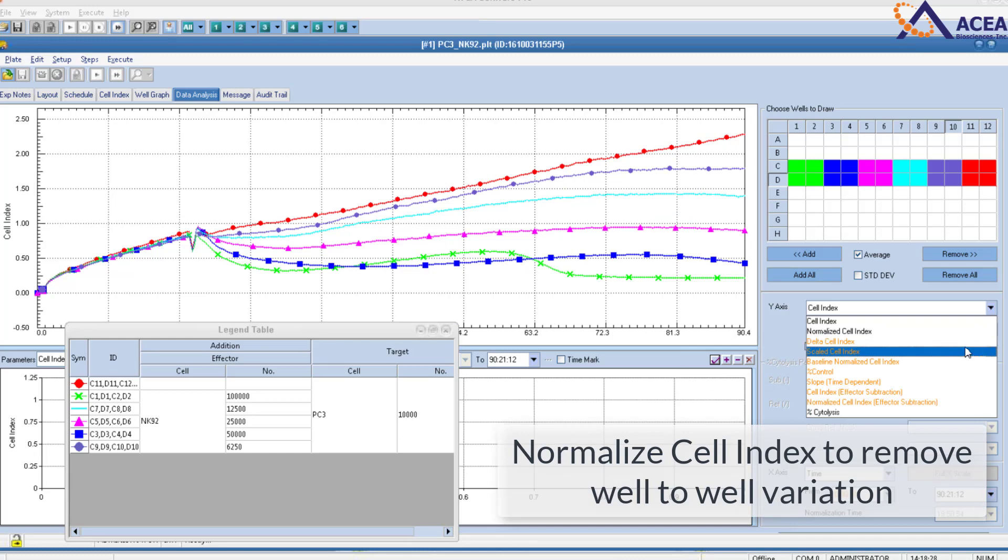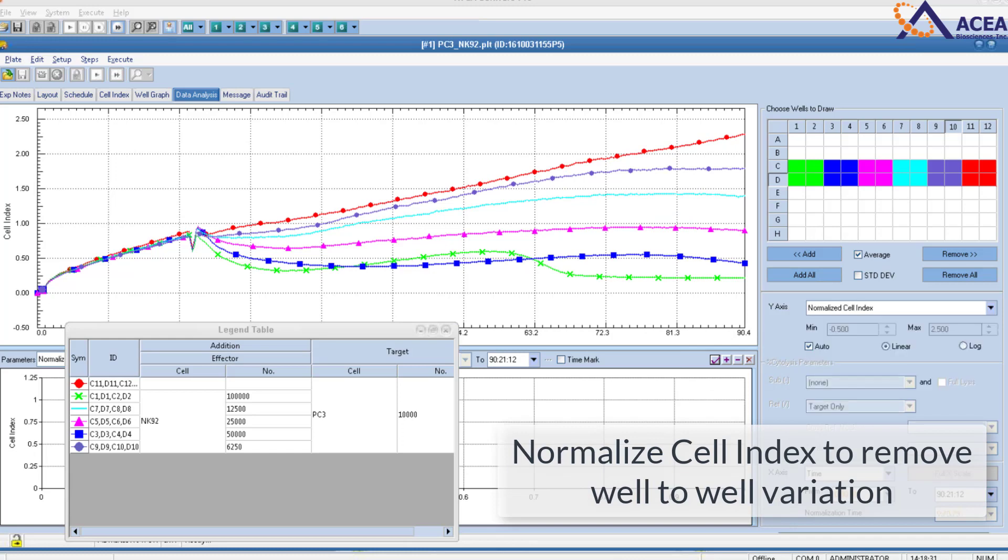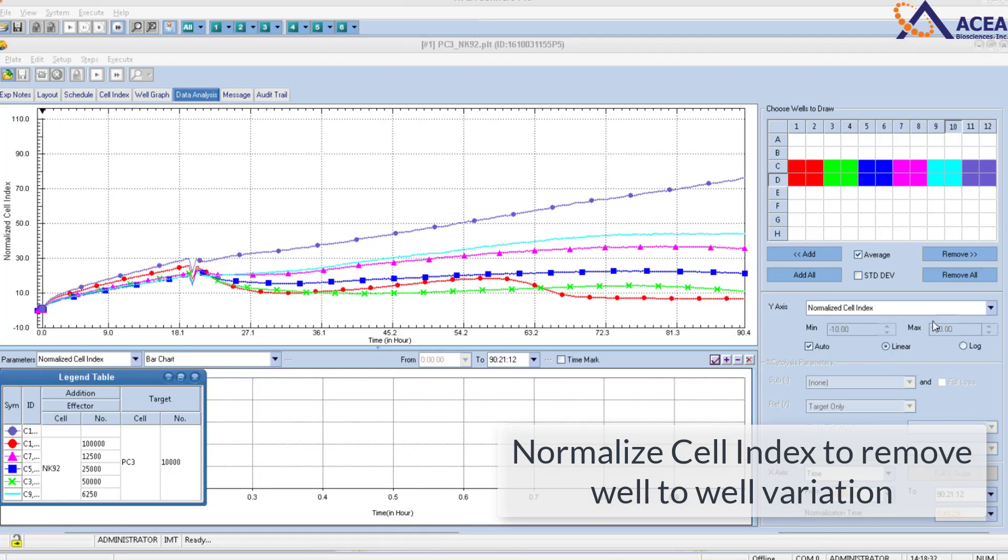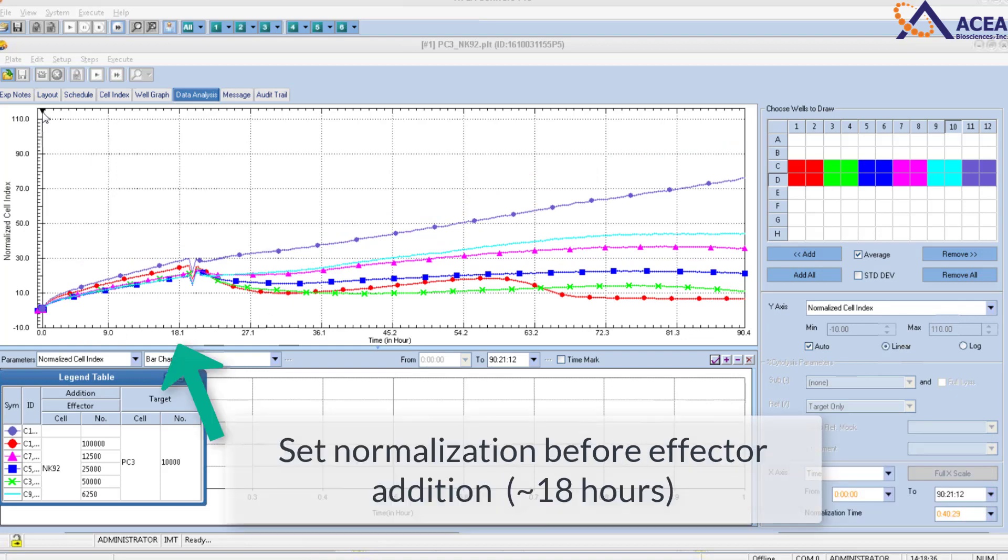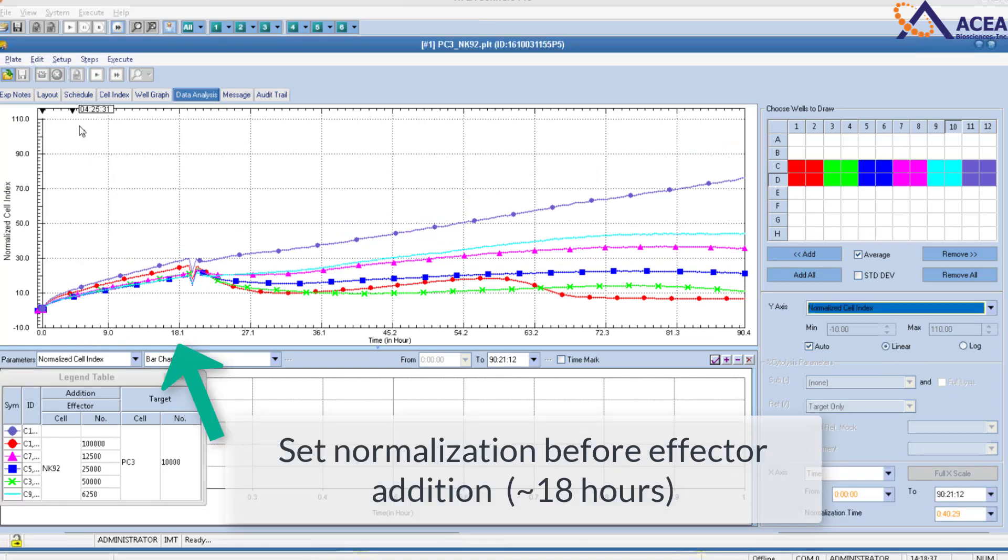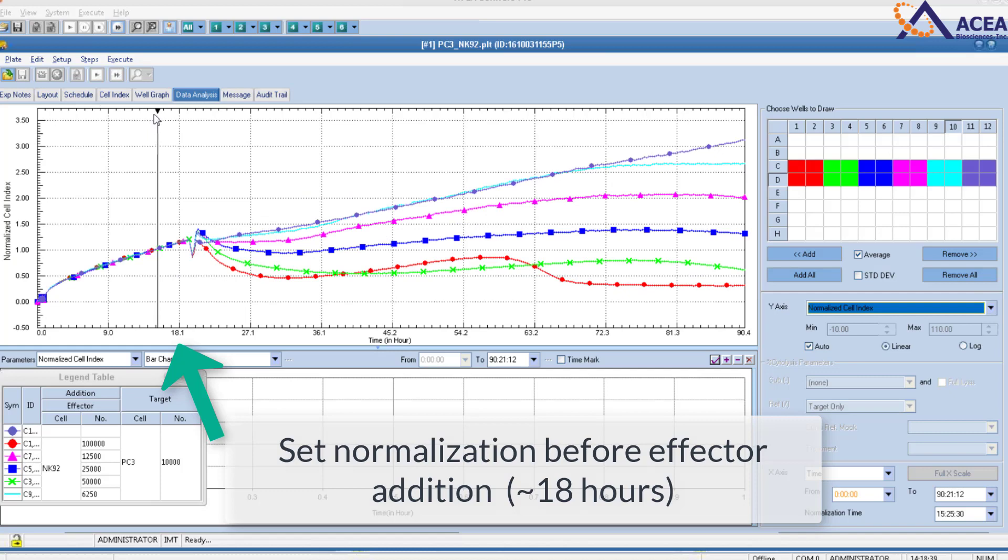Cell index can be normalized to remove well to well variation. You can set the normalization time point before effector addition.